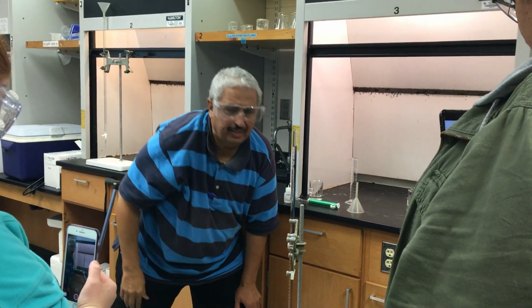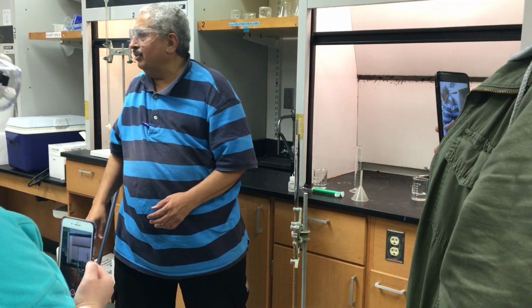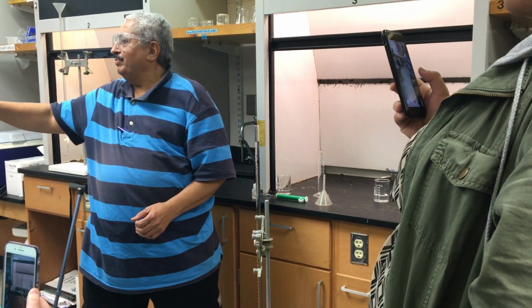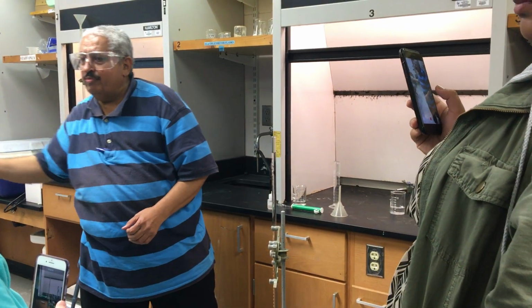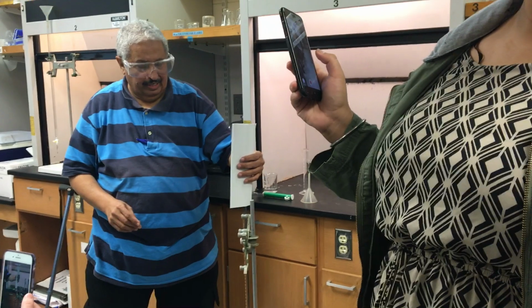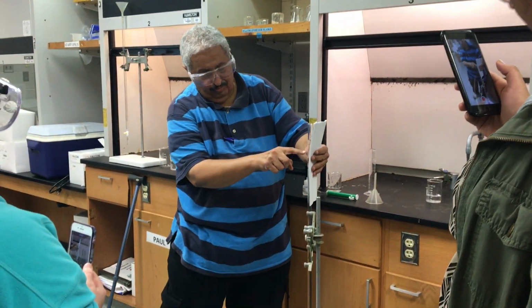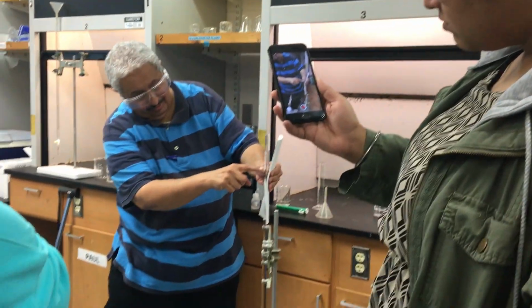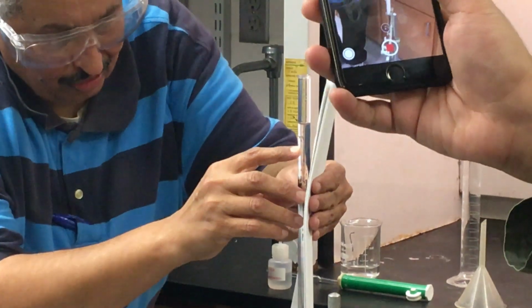So in this case, I need a tissue. Bring me a brown tissue here. Do you have a brown one? A brown one will be much better than the white one. But anyway, in this case, I do it this way. You can see it now. You see the 0, my 0. Where is my 0? Can you see it here? My 0 is here, and I'm above the 0, correct?